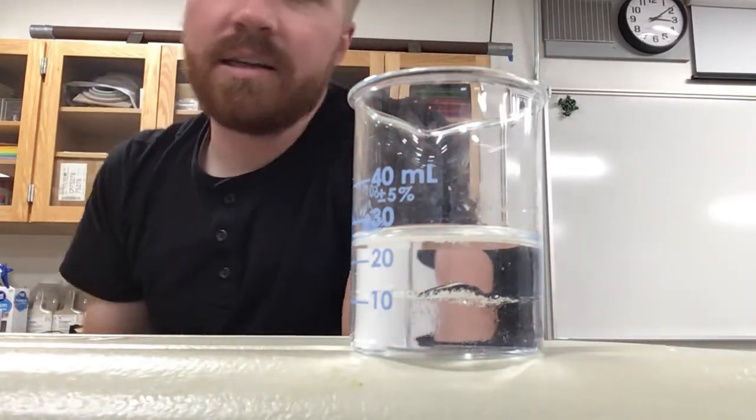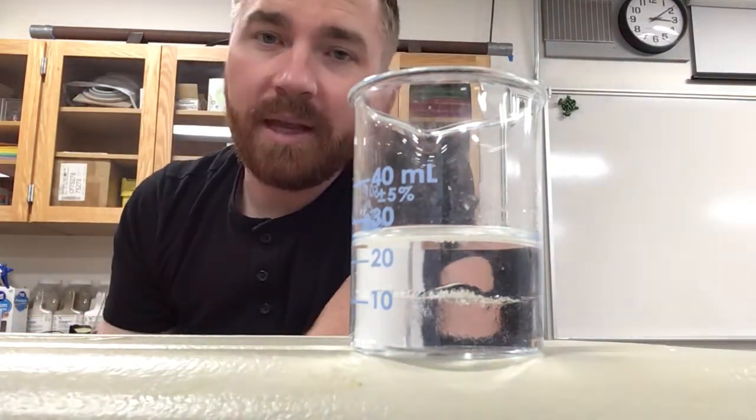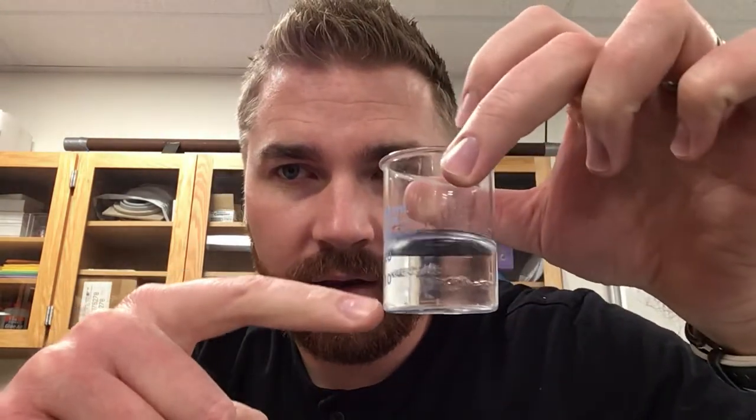Then in class, we talked about density a little bit. Let me move this camera. There we go. It's a little bit better. So in class, we talked about density and how density plays a part in different phases of matter. Which ones are the most dense, which are the least dense, and how it plays a part in this solution as well. Obviously the most dense solution is the one here at the bottom.